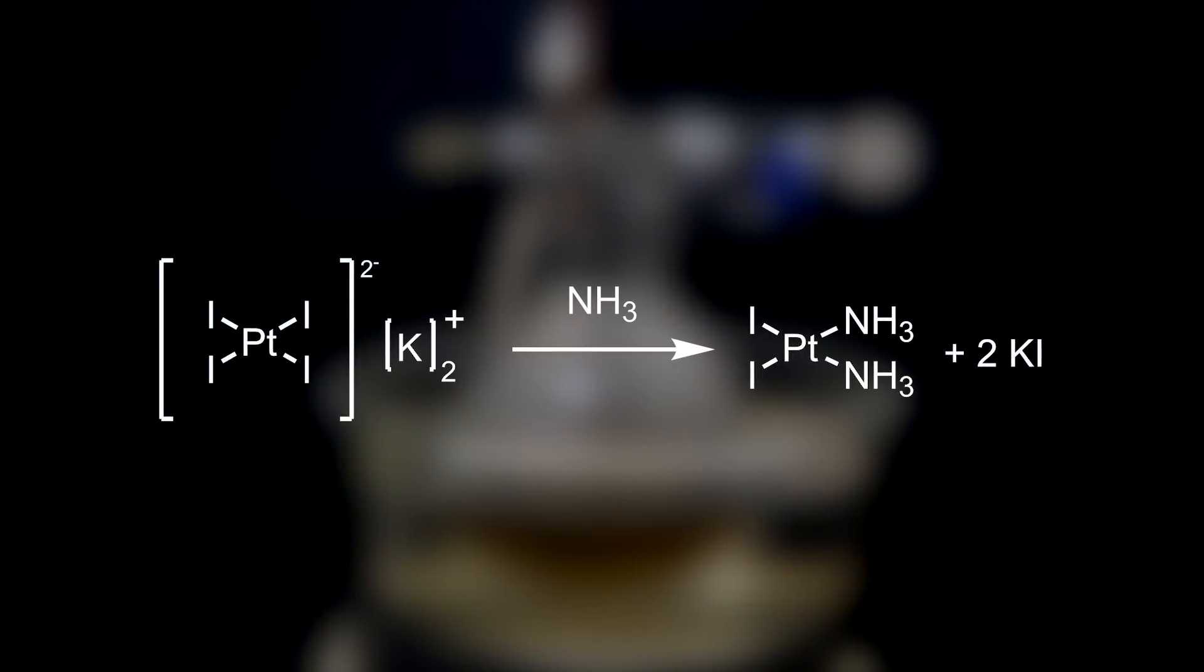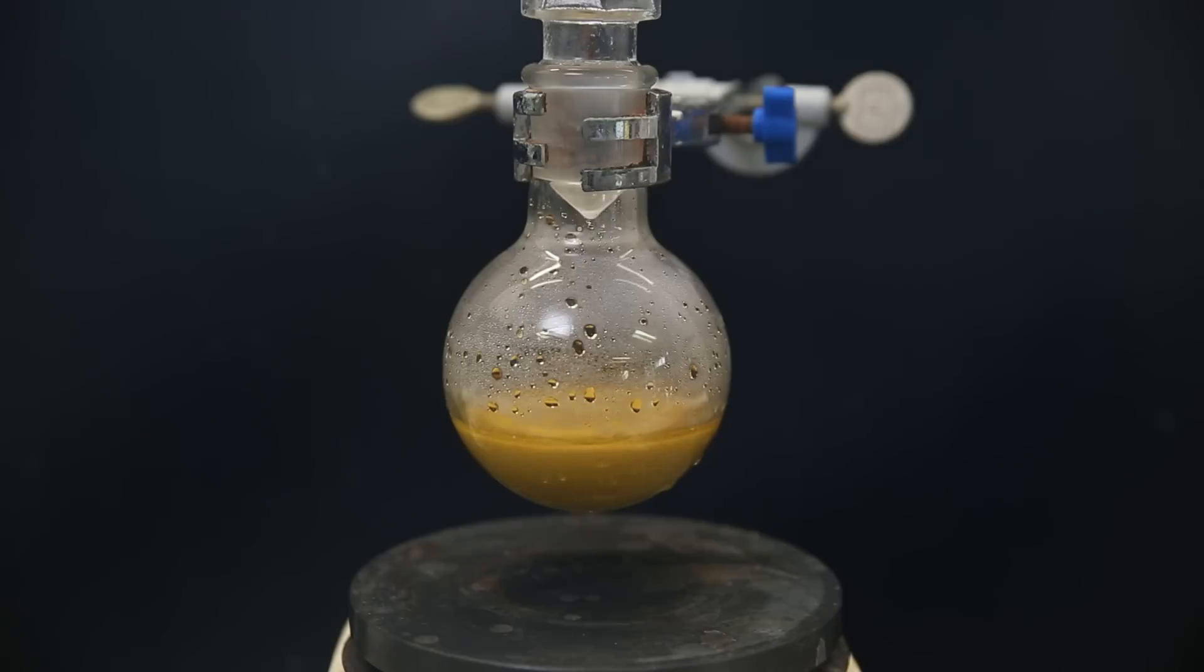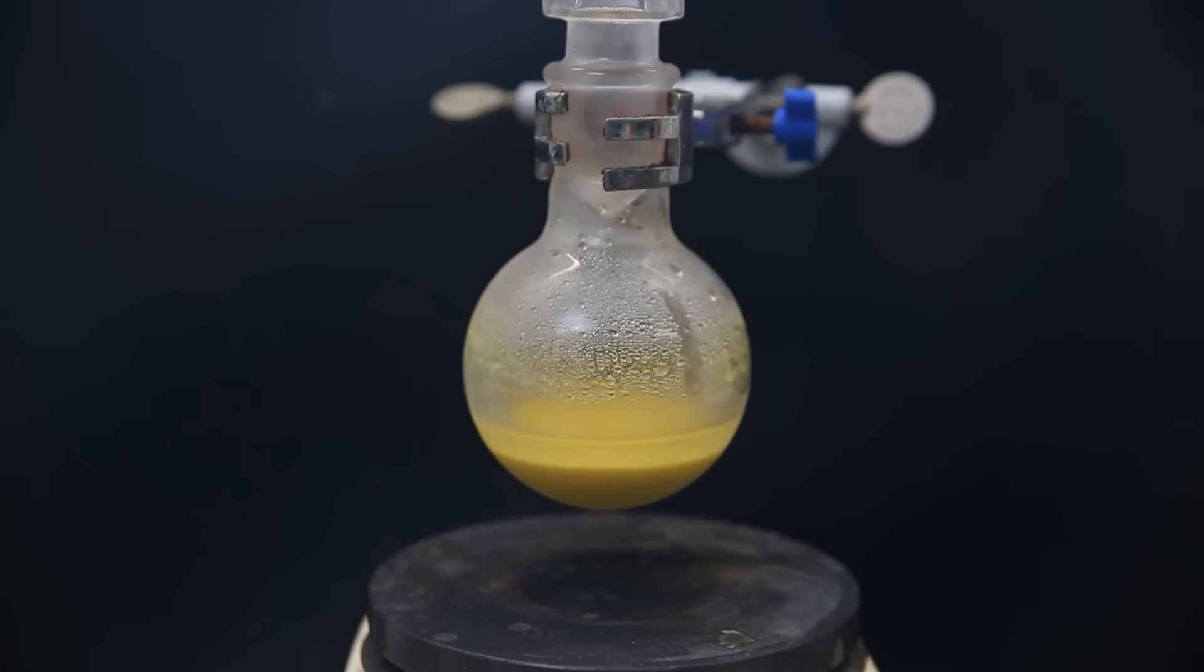In this reaction, ammonia coordinates to the platinum atom in the cis position and kicks off potassium iodide to form cis-diammine-diiodoplatinum too. I then take it out of the water bath and set it in the fridge to make sure it all precipitates out.